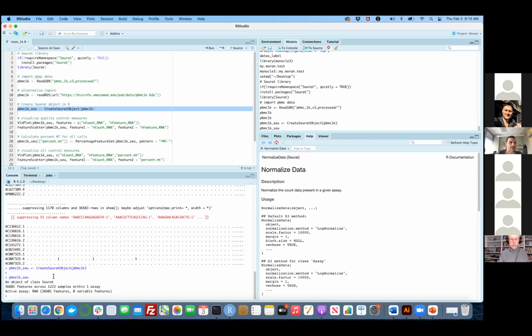Usually people wrap up built-in functions for you to do complex analysis like single cell. They come up with packages and they create objects like that in order to make people easily analyze their data without even thinking of creating different objects and other stuff. Of course, we're going to create some other objects, but eventually we'll be using this Seurat object only.